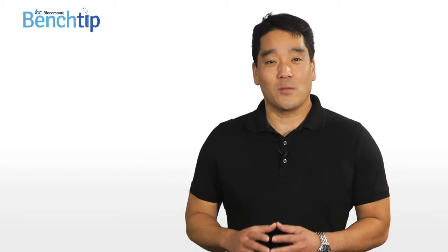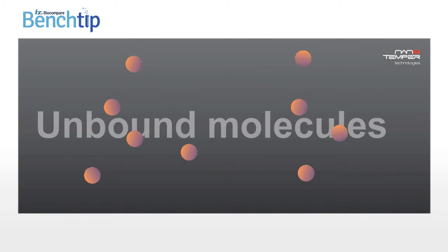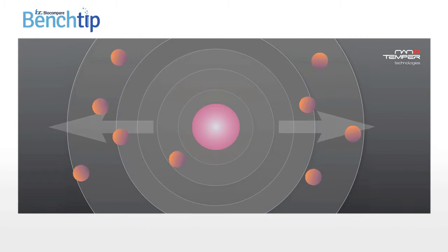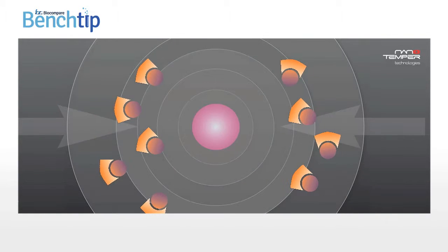So how does it work? The technology is based on the fact that molecules move within temperature gradients. This is called thermophoresis. This movement depends on a number of factors, including the hydration shell, charge, and size of the molecules. Molecules or particles are initially distributed evenly and diffuse freely in solution. When the IR laser is switched on, unbound molecules typically move out of the heated spot. Binding of one molecule to another thus results in altered movement across the temperature gradient.